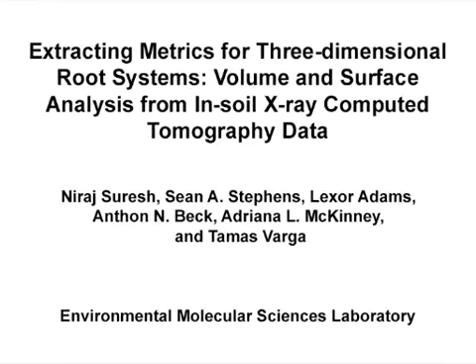The overall goal of this procedure is to extract quantitative information on plant roots from in-soil X-ray computed tomography data. This method of investigating the root structure of live plants can help answer key questions in the biology field, such as how plants respond to changing environmental conditions, like drought, microbial activities, and so forth.